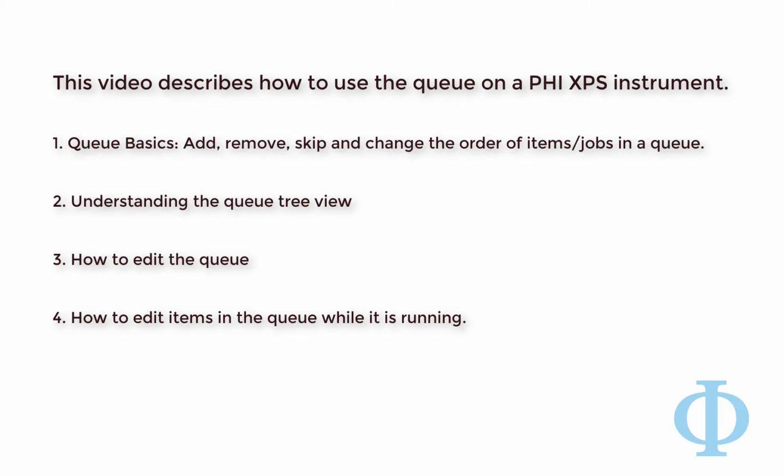Section 1. Queue Basics. Add, remove, skip, and change the order of items, jobs in a queue. Section 2. Understanding the queue tree view. Section 3. How to edit the queue. Section 4. How to edit items in the queue while it is running.